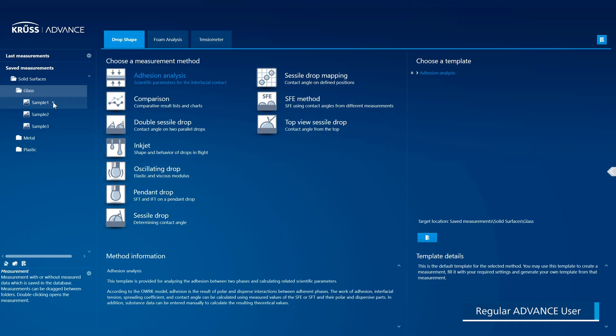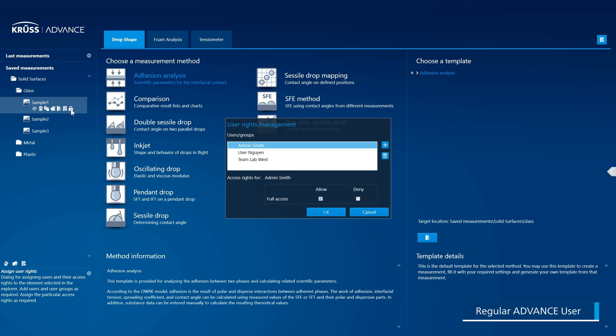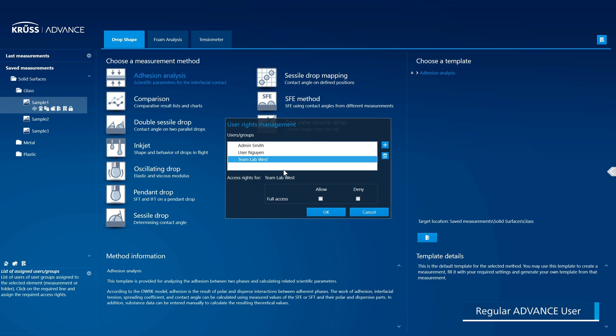Furthermore, by means of the button for User Rights Management, every user can share their measurements with other users or groups. The User Rights Management facility in Advanced enables you to achieve the ideal balance between transparency and data security.